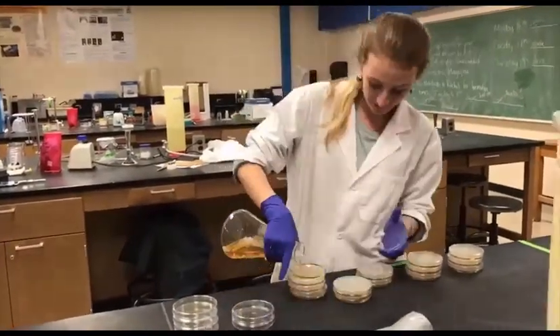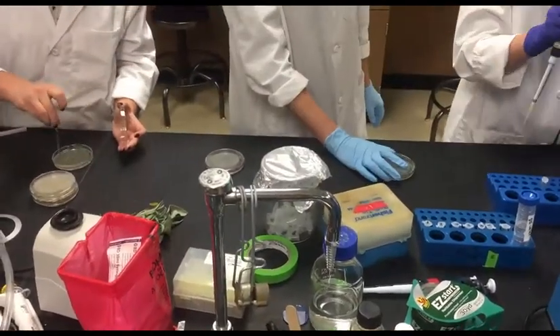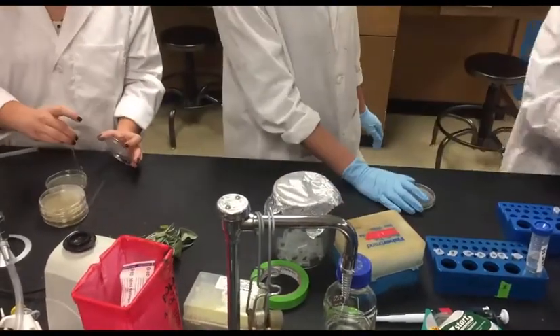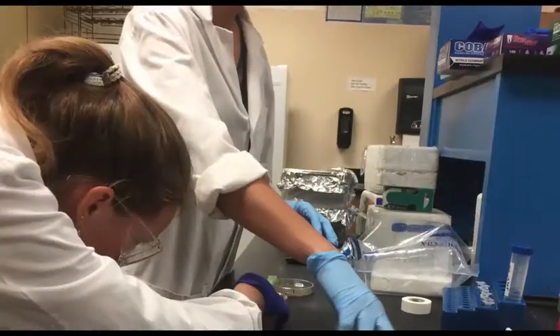We prepped a general media, TSA, MacConkey agar to select for coliforms, and TSA plates containing either ampicillin, tetracycline, or gentamicin. We diluted and plated the influent water to obtain growth on non-selective media. Our goal was to obtain between 30 and 300 colonies on a plate to be used in replica plating.